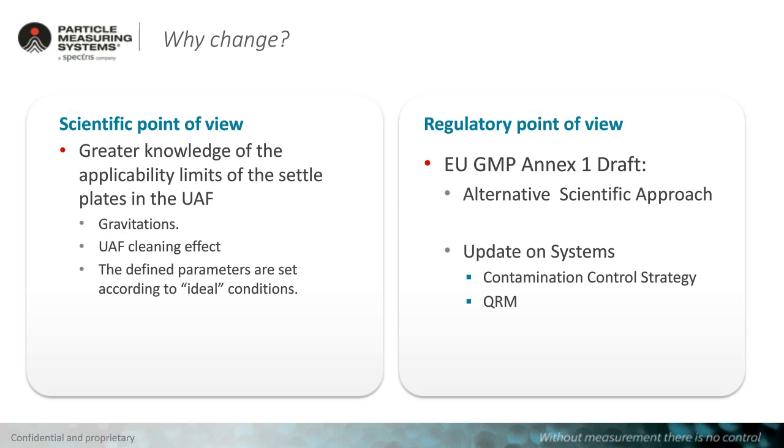This also requires an update of the systems, and many of you may have heard that the EU regulatory bodies now request a contamination control strategy, which is really a new, complete system that they expect in order to avoid contaminations in a clean room.